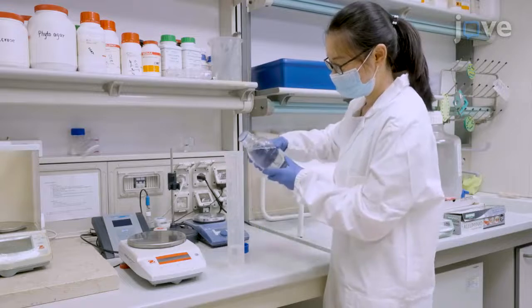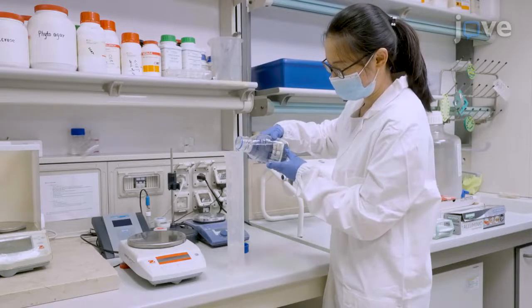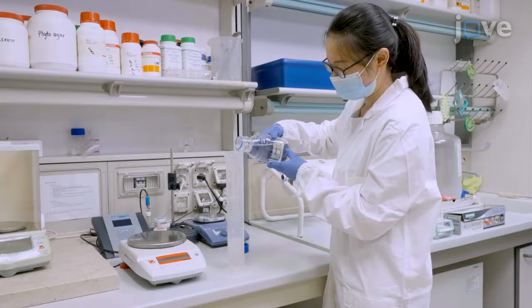To begin, prepare 70% ethanol by adding 95% technical ethanol to distilled water and mixing thoroughly.